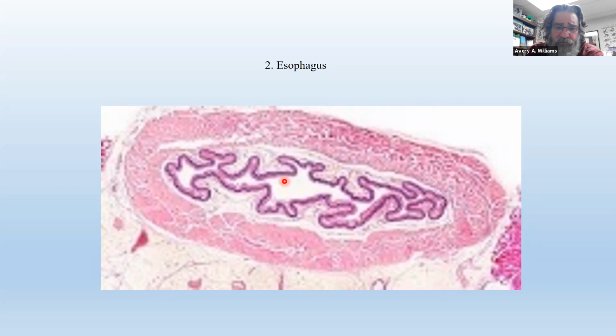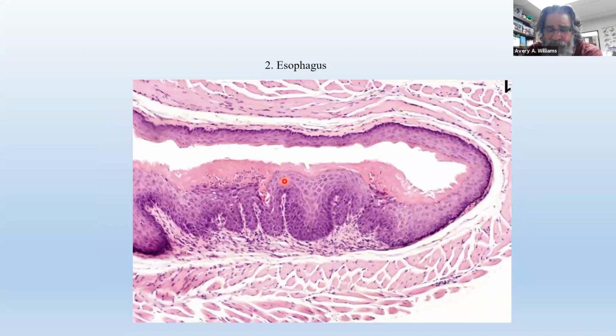All right, so let's have a look. The previous slide was magnified maybe about 40 times. Here we are at about 200 times looking down the lumen. A much prettier slide, a nice view. You can see some very distinct cells right here. This is the inner lining. Some other tissue out here, and then there's some other tissue right here.